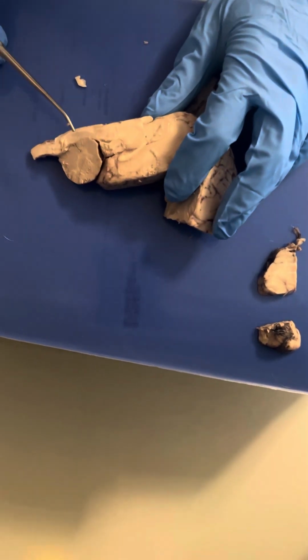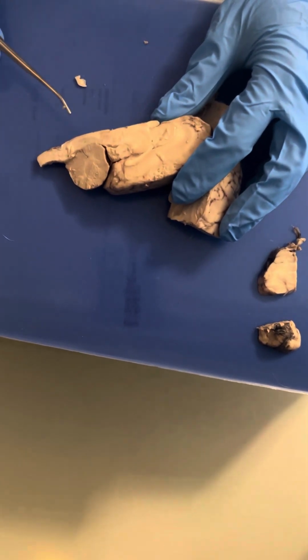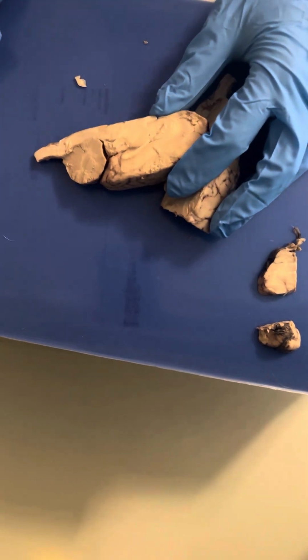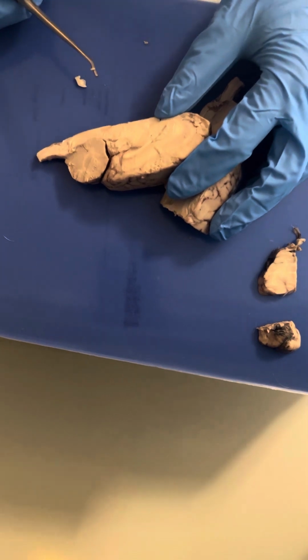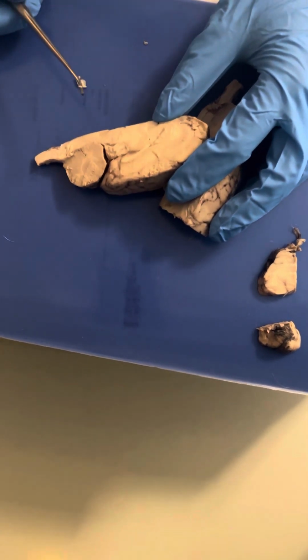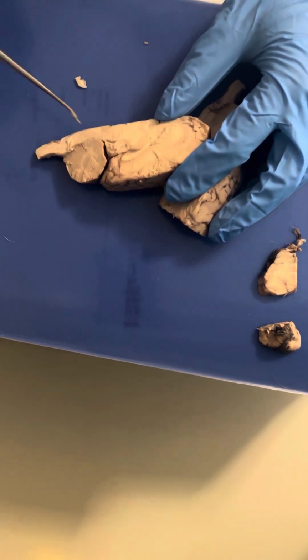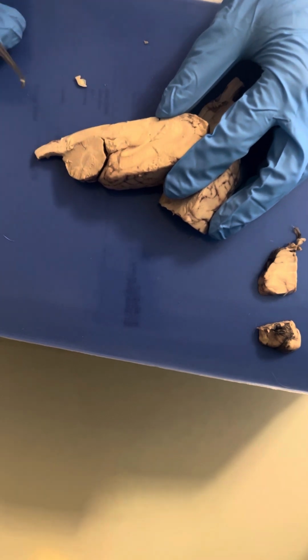And then the hippocampus helps decipher different emotions, which also aids in converting short-term memory to long-term memory. Then there is the 3rd ventricle and the 4th ventricle, which are separated by the cerebral aqueduct, which holds the cerebrospinal fluid. So in addition to those 4 different ventricles, there are also different sections, the cerebrum as mentioned earlier.